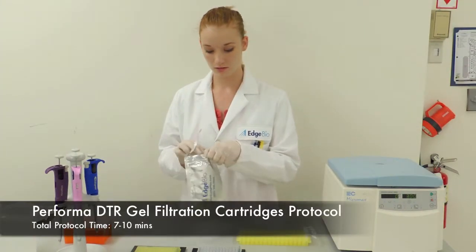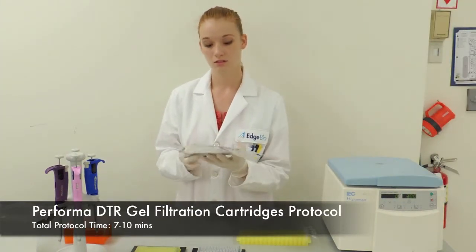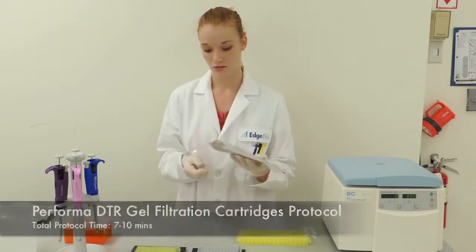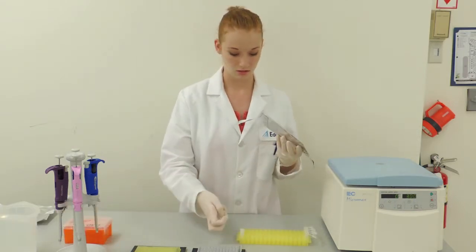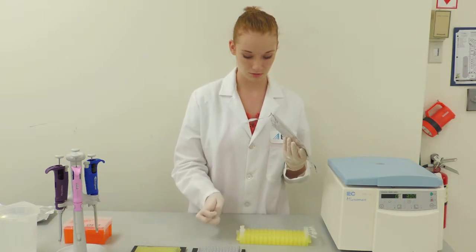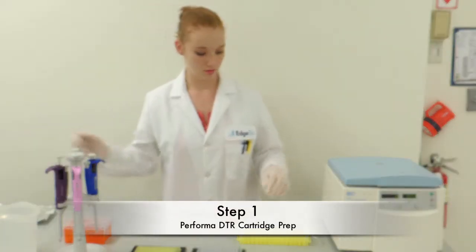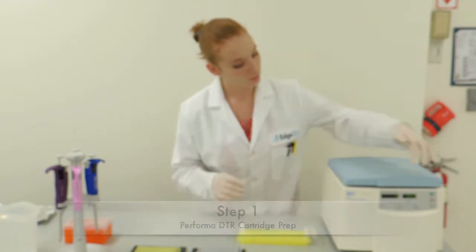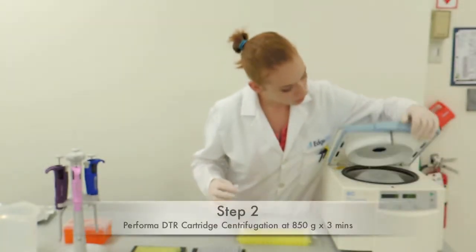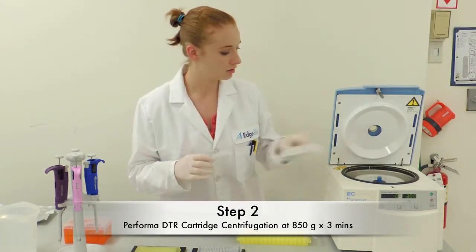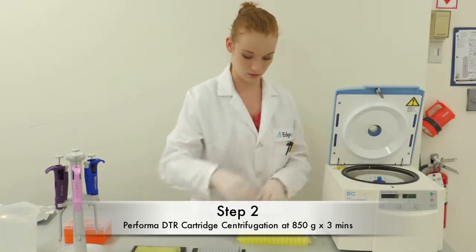The procedure for our Performa DTR cartridges is very similar to that of the plates. The total processing time for this protocol is also 7 to 10 minutes. The first step requires removal of the desired amount of cartridges from the foil pouch. The cartridges are then moved to a centrifuge and spun at 850 Gs for 3 minutes.